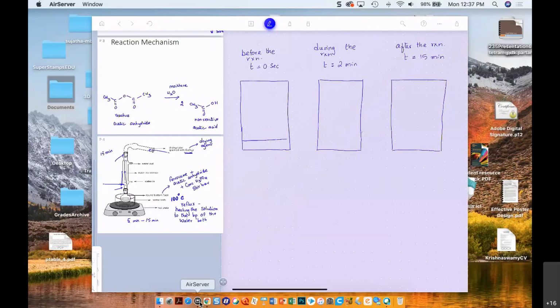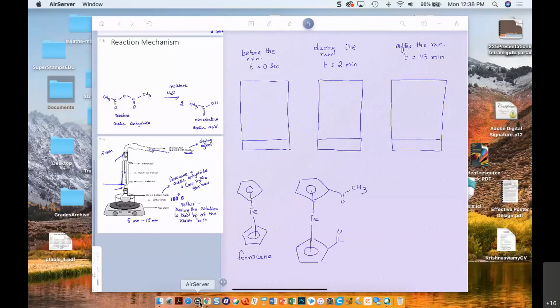So we'll get these. Now we have ferrocene, just to kind of give you the structures again. Or if you already know that, that's good. So this is our ferrocene. Then we have your acetylferrocene. We do need a little bit of idea on the structure in order to determine the polarity, because TLC is very much a polarity issue. Okay, I just wanted one acetyl group, and then we'll have another one where we have 2 acetyl groups. So I'll go fast here.